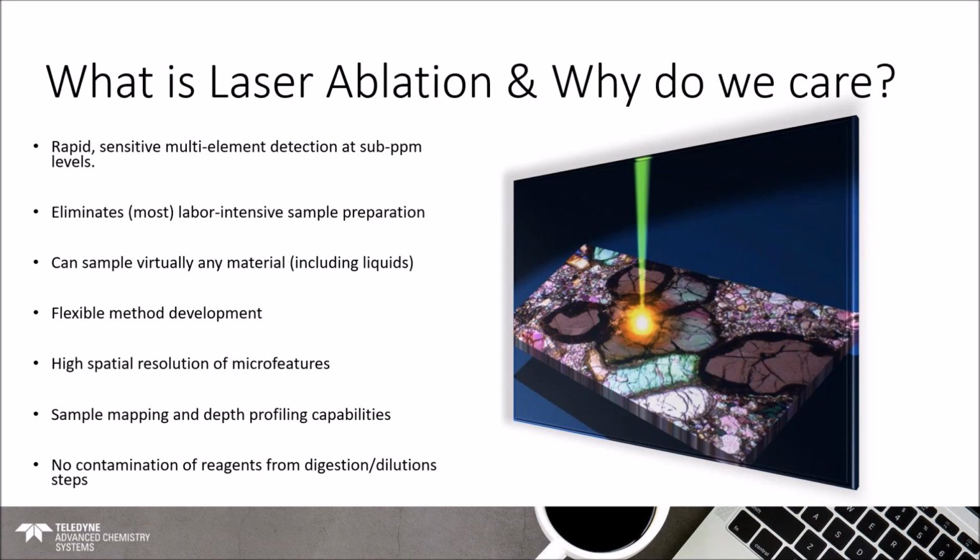You're also able to do depth profiling with the technique, which can also be very useful with some applications. I used microchips earlier, I'll stick with that. There can be a layer of gold found within microchips that, of course, if you were to do dissolution, would just become a portion of the mixture. But with laser ablation, you're actually able to drill down through the sample. You can find that layer in particular and analyze it, and even any contaminants that might be within the gold itself. So very, very advantageous there.